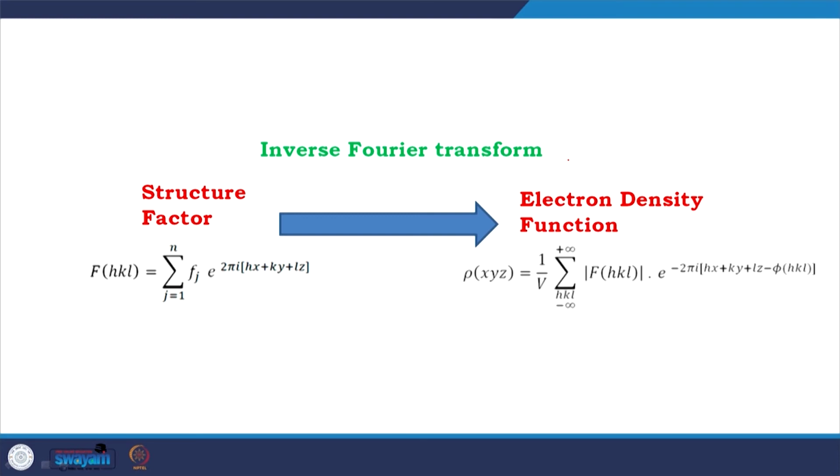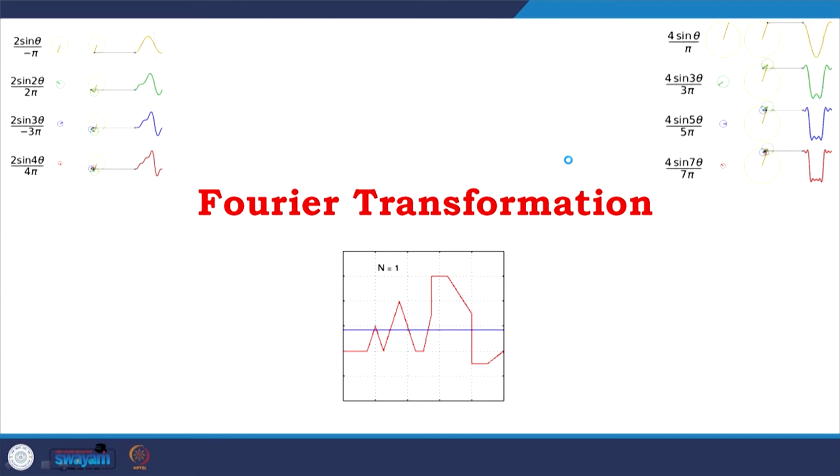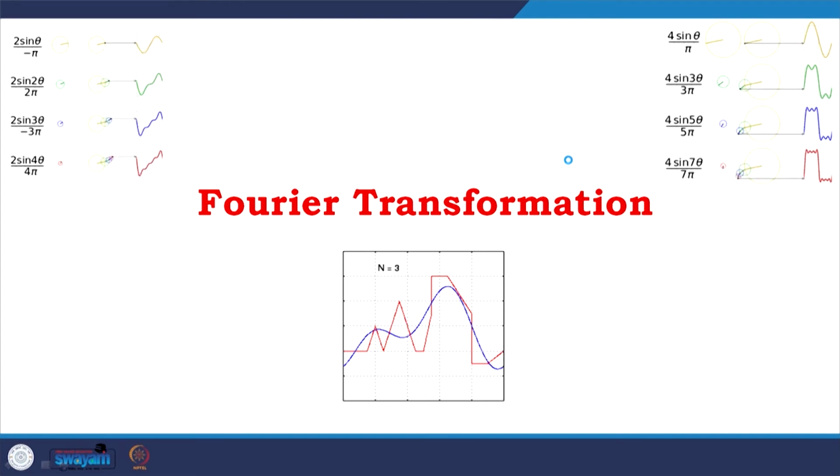Now, we know about this, but we do not know what an inverse Fourier transform is. So, let us try to understand what a Fourier transform is. It is not with all of you, but when I teach in the class and call it Fourier transformation, people become afraid.